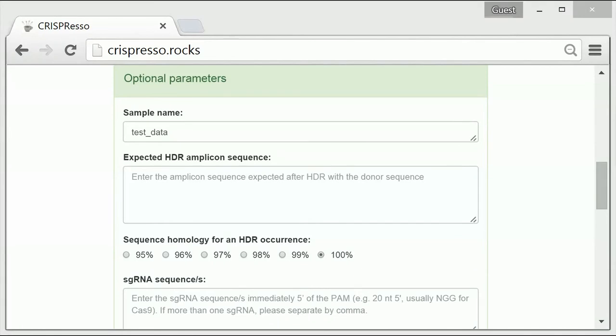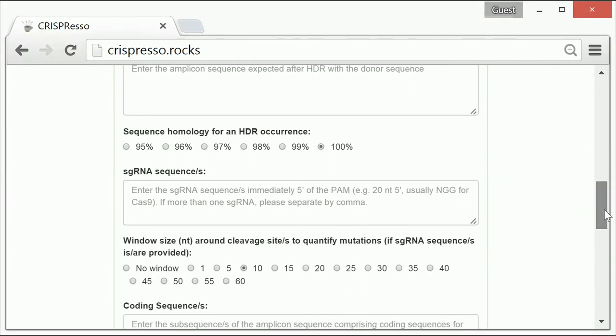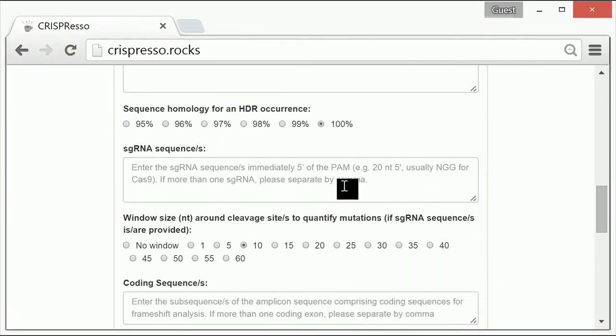The fourth optional parameter is to enter the guide RNA sequence. If the guide RNA sequence is entered, then the position of the guide RNA and the cleavage position will be indicated on the output analysis files.